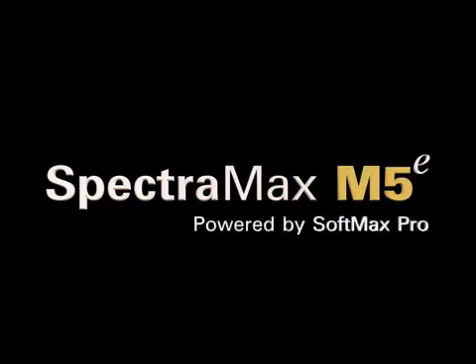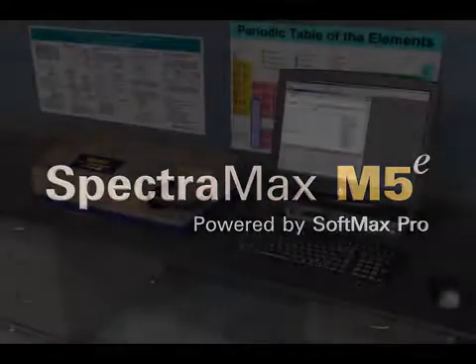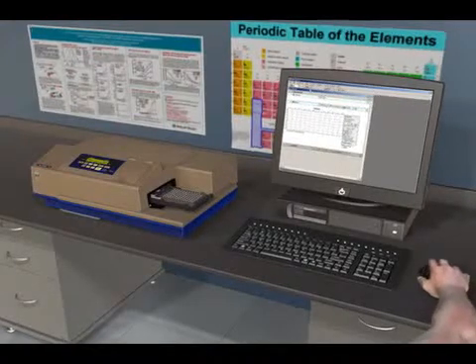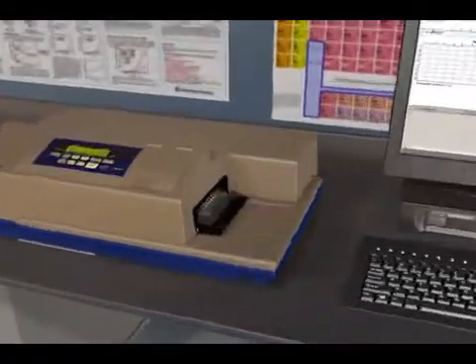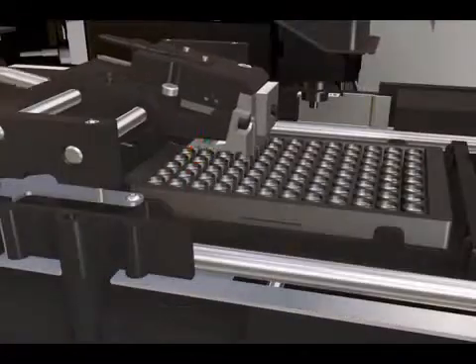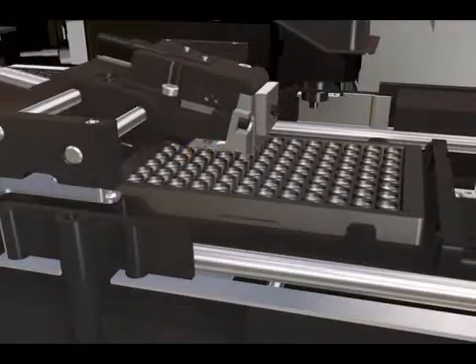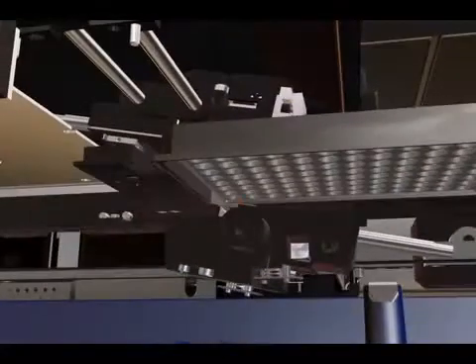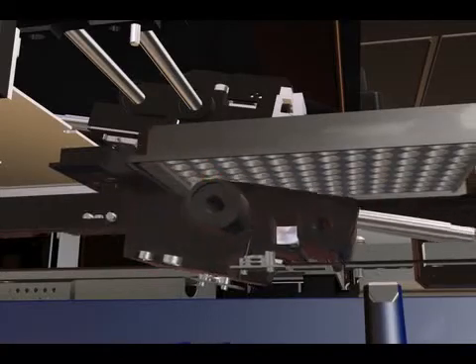The SpectraMax M5e Multi-Mode Plate Reader comes ready to use in your lab with our integrated SoftMax Pro software for data collection, analysis, and graphing. Our patented Auto-PMT and Smart Optics systems ensure optimal results with minimum user intervention for top or bottom reads for all modes.